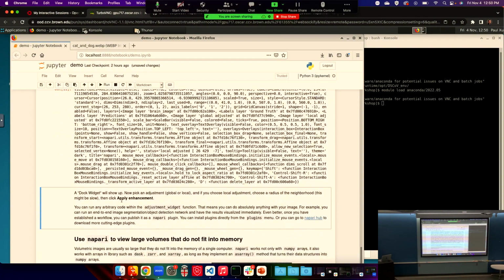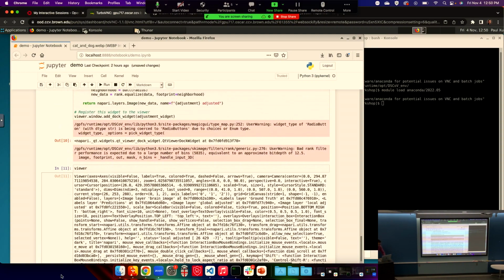Yeah, that viewer is still there. It's not deleted. But it might not be able to... I don't know how to, maybe there's a way to load that interface again and have all of your data in there. And we can also check if all the layers are in there, because the layers are just represented as a list, right?